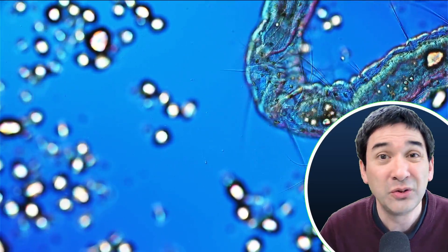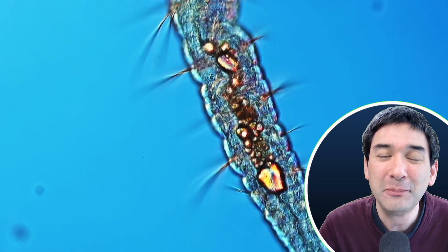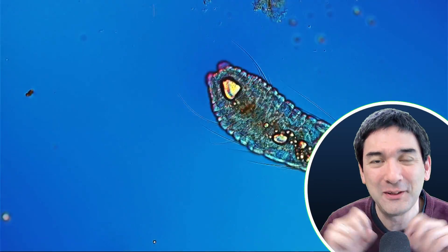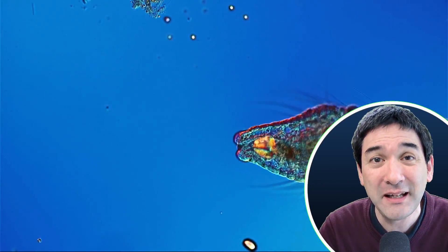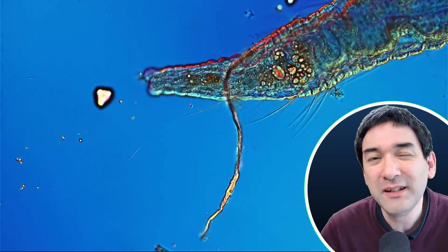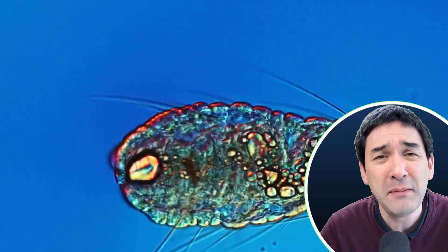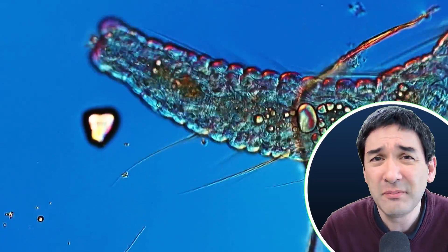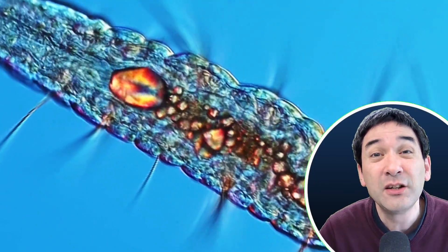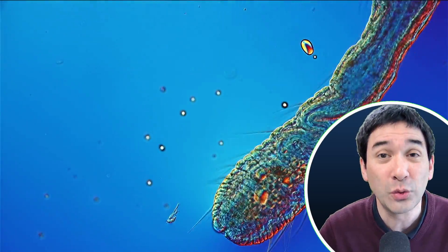I could see that the starch grain was traveling back and forth inside the intestine of the worm, but it really did not travel backwards very much because it got stuck — it was pretty large. After a couple of minutes, I could actually see that the worm did manage to poop it out, and then it was basically released again, probably to be eaten by the next worm. This kind of showed that the starch was not easily digestible for the worm — it just stayed in there for several minutes — and apparently the starch grain itself was not digested; it did not become smaller, so it really did not serve as a good food source for the worm.